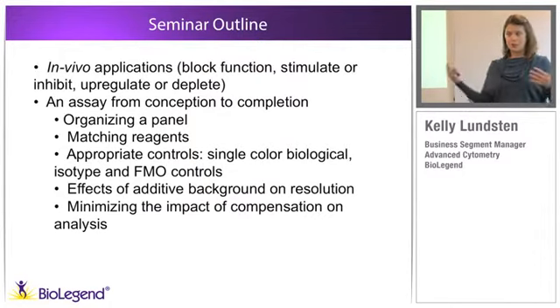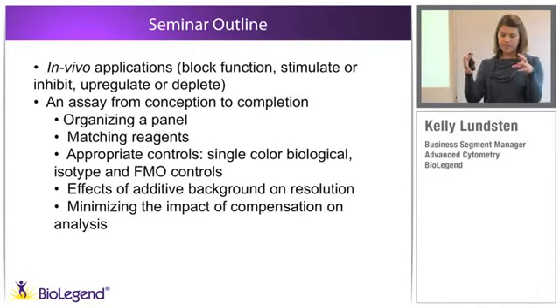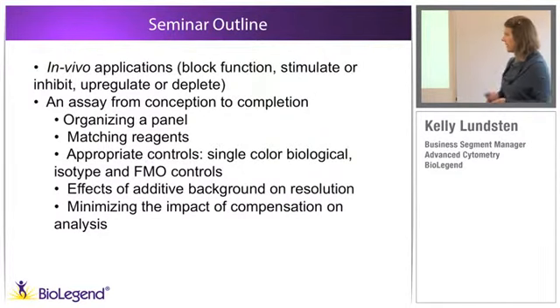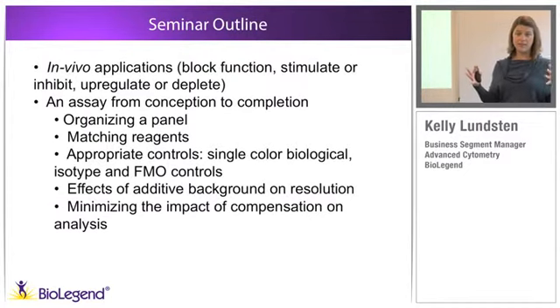This particular assay is going to show you an example of 15-color immunophenotyping. When you get to that level and you're forced to use fluorophores like PE-CF594 or PE-Cy5, which are nestled into a space where a lot of fluors with overlapping spectra are populating, that can have a big impact on the spread of the MFI negative.